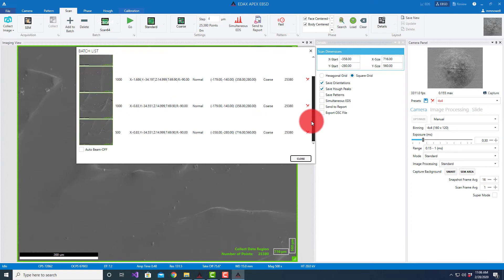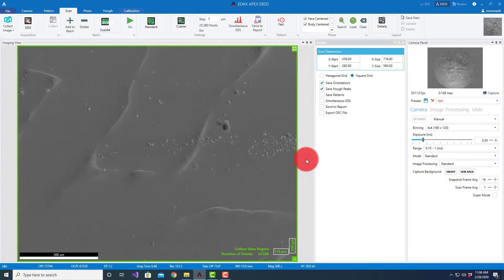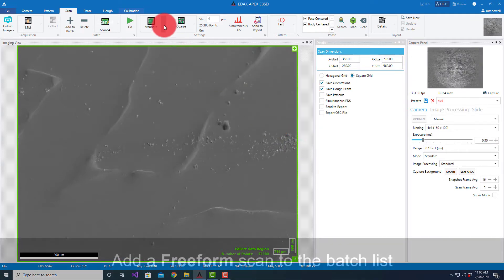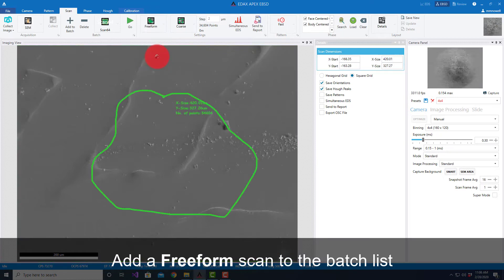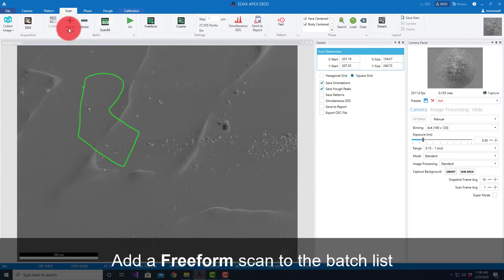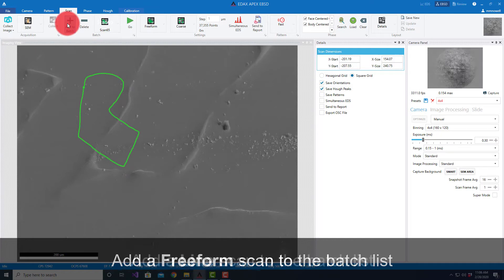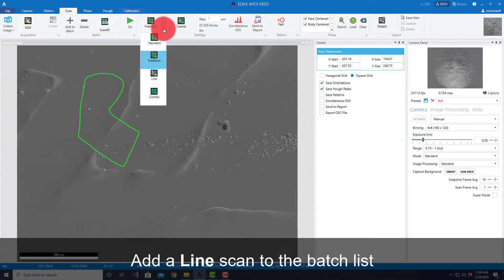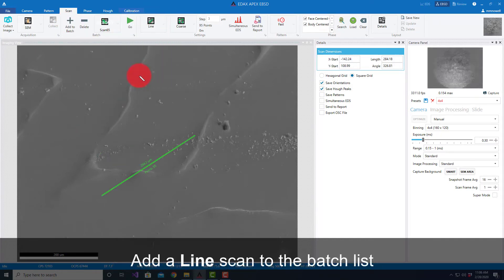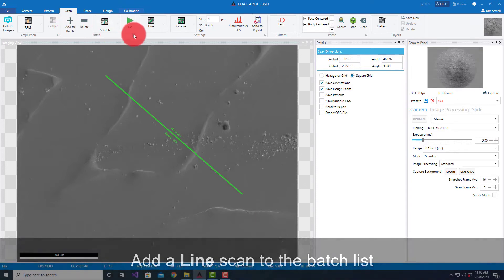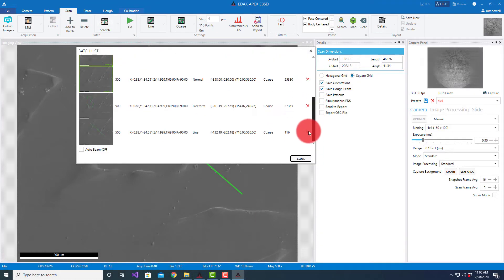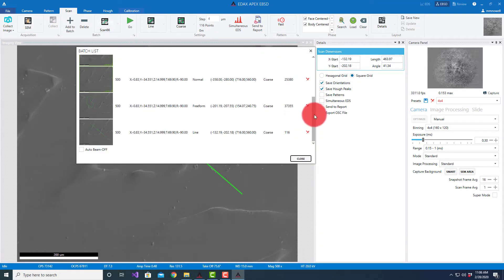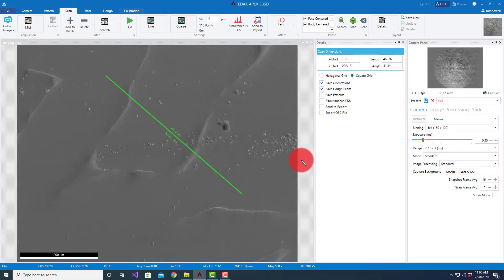If I wanted to, I could also add a freeform scan, something like that. Maybe I'll add one that looks like this. I can add that to my batch. I could also add a line scan, add to batch. If we look at my batch list, you'll see here I have a freeform scan and a line scan. So now I have six different scans ready to collect.